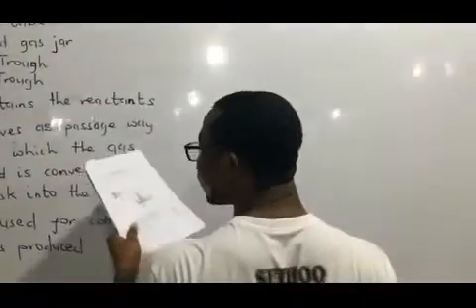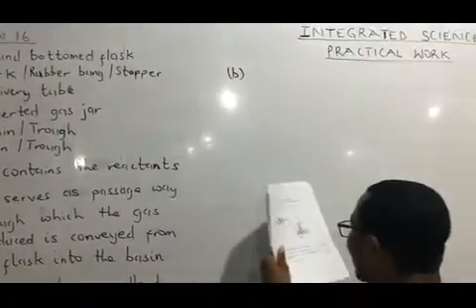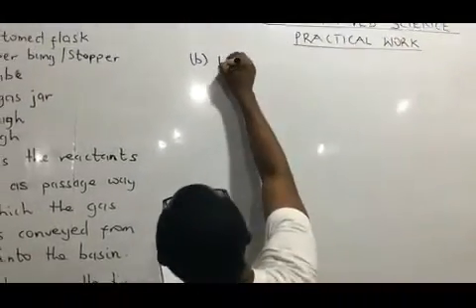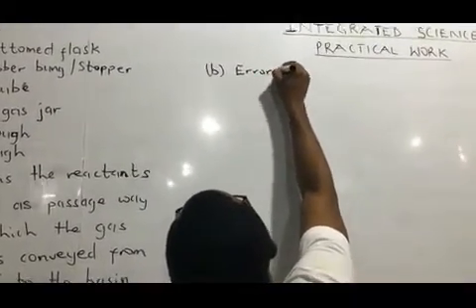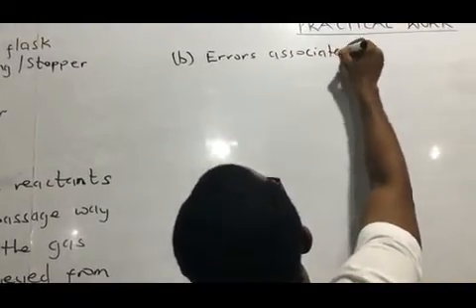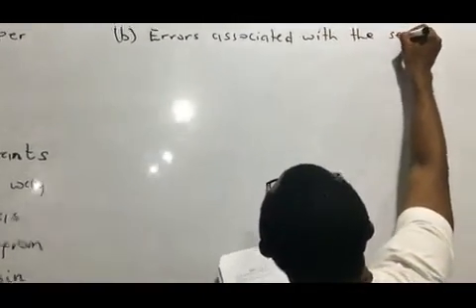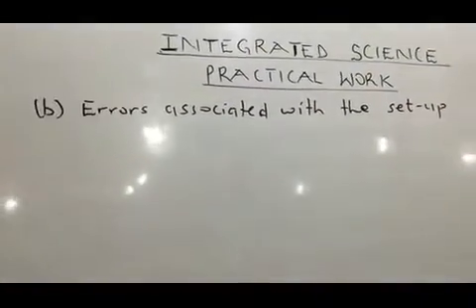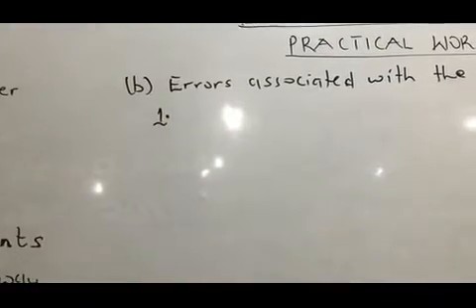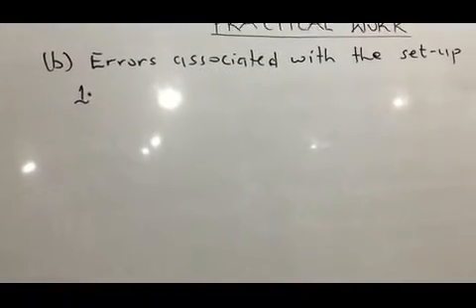Question B. It says identify 3 errors associated with the setup. One.